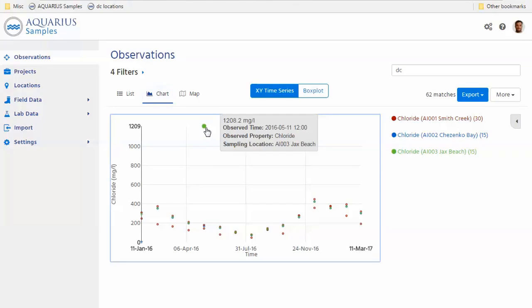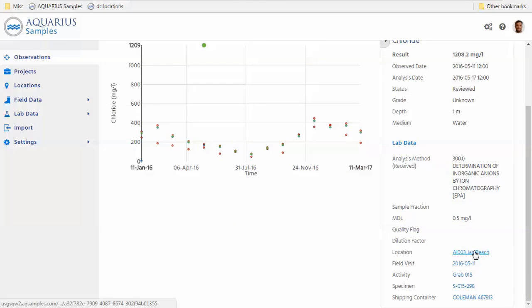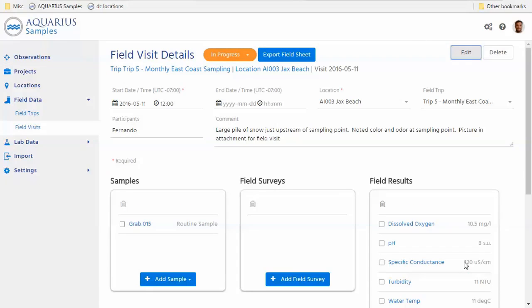I know we hear from customers all the time that they are doing this kind of analysis today, but it's pretty hard because they've got to fish around for all the data. So for example, they sometimes have to go back and look at field notes, or they have one person whose handwriting is hard to read, and so on. So the additional data in samples that we've seen are all good examples of what we're trying to accomplish here at Aquatic Informatics, and that's to build modern and simple, intuitive systems that allow our users to instantly be productive and successful.